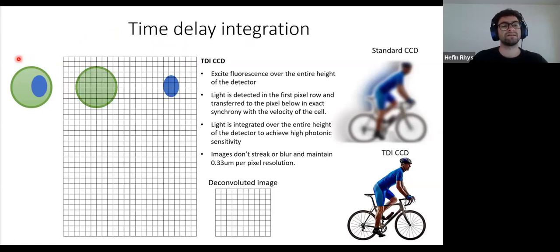So if you imagine a cell traveling through the flow cell being illuminated, and say the cell has GFP and DAPI staining, for example. The set of filters will reflect the different band passes of light onto different portions of the cameras.